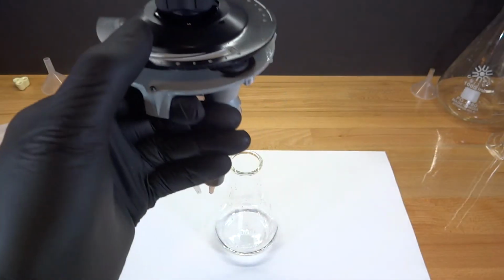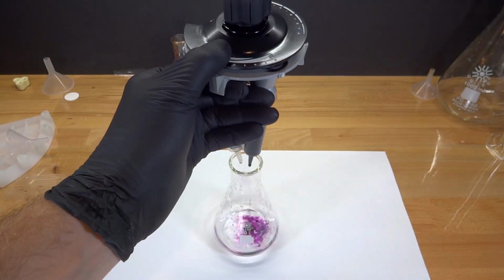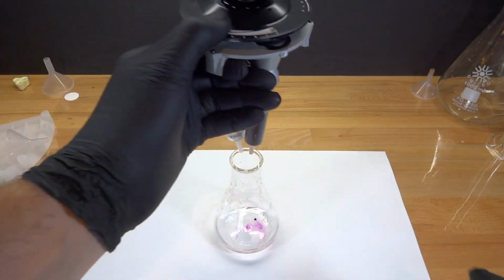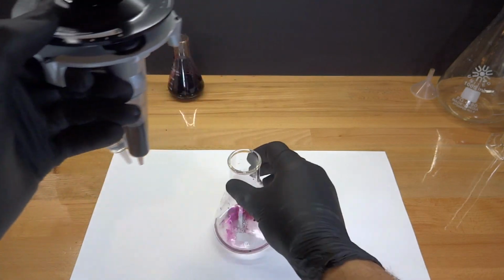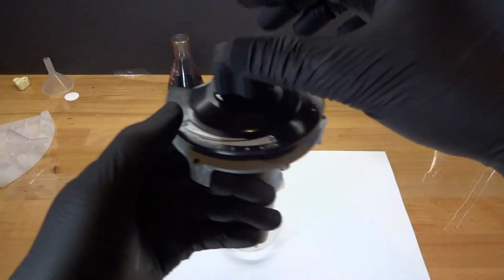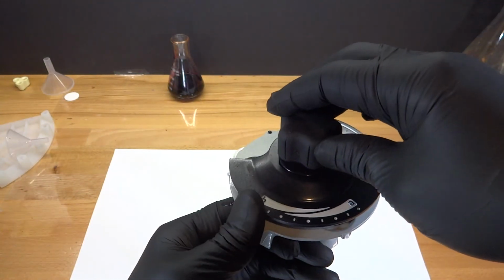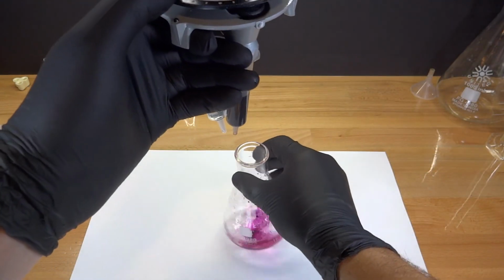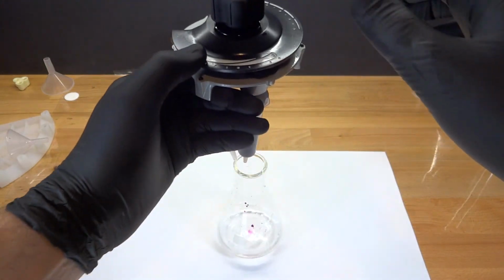We'll start the second titration by dispensing roughly 1/4 of titrant to 3/4 of analyte by volume. There is no need to experiment with a 1-to-1 solution anymore, so we'll start with only sulfuric acid in our flask. We'll perform a total of 3 titrations for a more robust data set. A variance of 5% is expected in the resulting volumes.